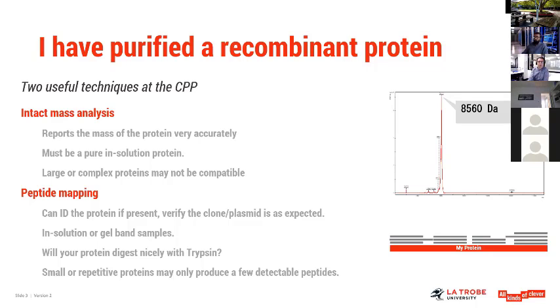And in peptide mapping, in this little diagram, you've got a red bar here representing the sequence of your protein, and these little gray peptides map to different regions of the protein and would tell you that, oh yes, in this case, I have actually identified most of my protein, it's present, it's got the right sequence, I'm good to go with further experiments.